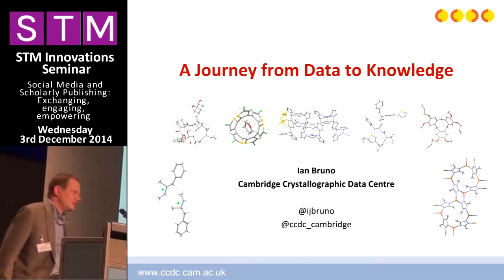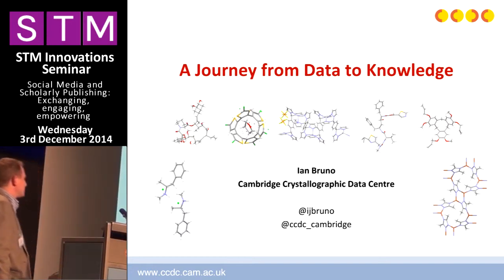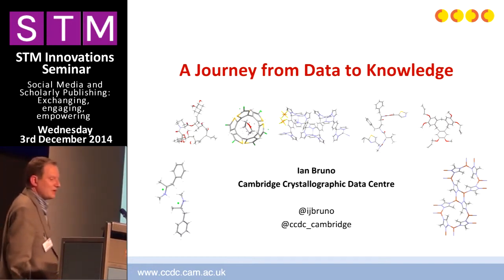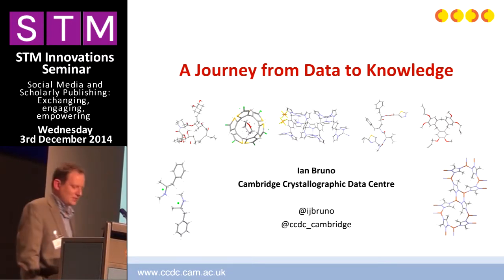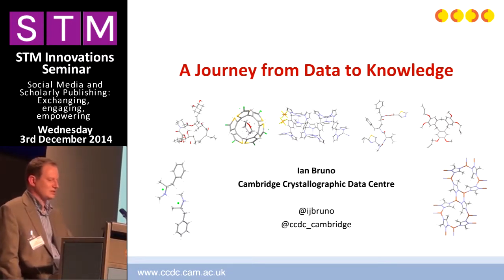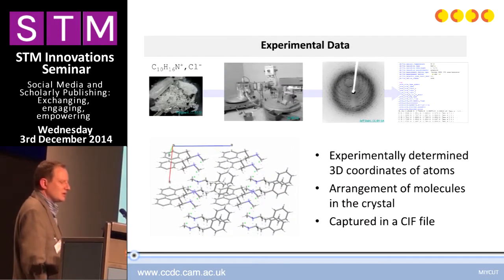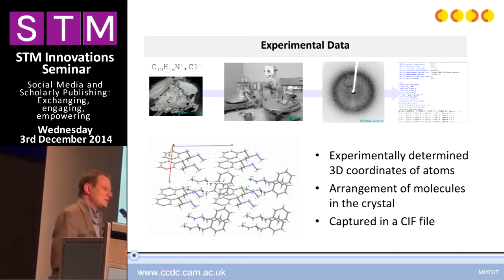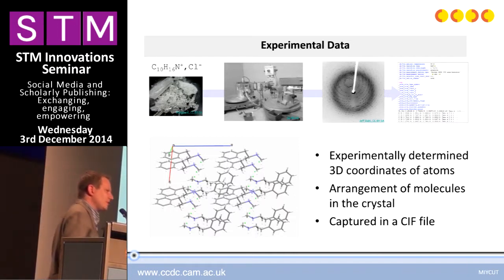Okay, thank you for the introduction and for this opportunity to take you on a journey from data to knowledge in the company of a cast of crystal structures as we take a tour of the services provided by the Cambridge Crystallographic Data Center. Our journey begins with an experiment on a diffractometer, the result of which is the experimentally determined positions of atoms in a molecule and an indication of how those molecules are arranged in a crystal. This is all captured in a CIF file.